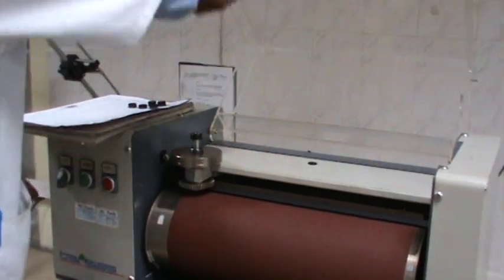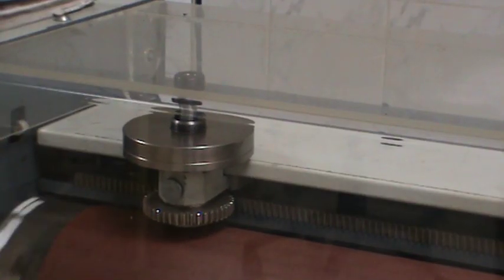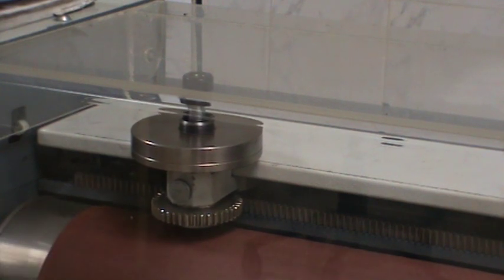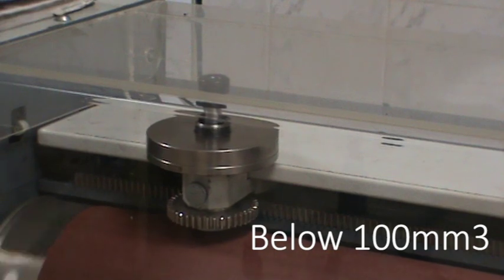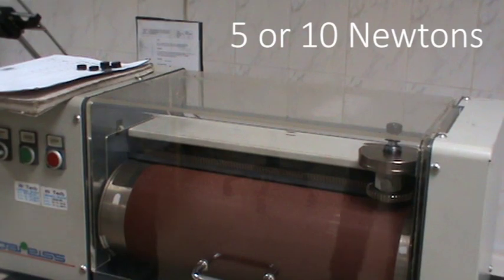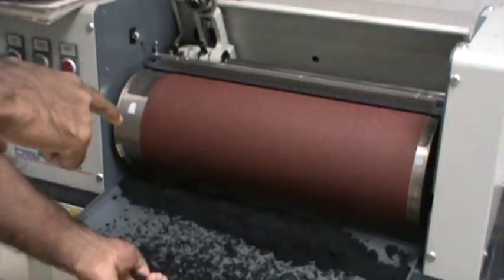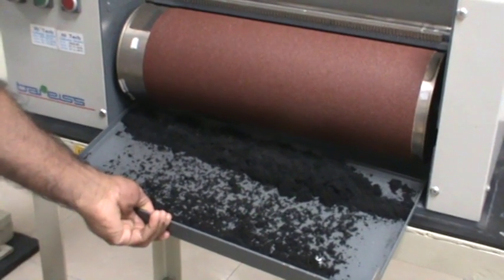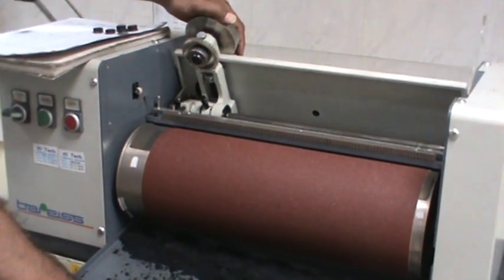It is desirable to have a lower abrasion loss reading, particularly where the rubber is in high abrasive applications. Highly abrasion-resistant compounds will have results below 100 cubic millimetres. It is important to note that the arm holding the rubber plug can weigh 5 or 10 newtons, and this should be quoted when the test result is given. The typical test is conducted in dry conditions, and a separate test method is employed for wet abrasion testing.